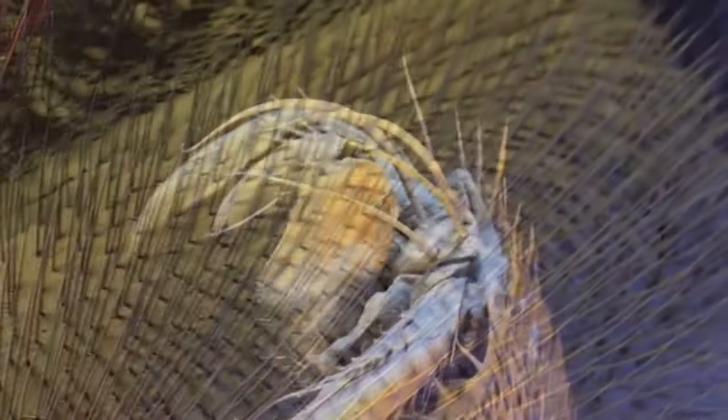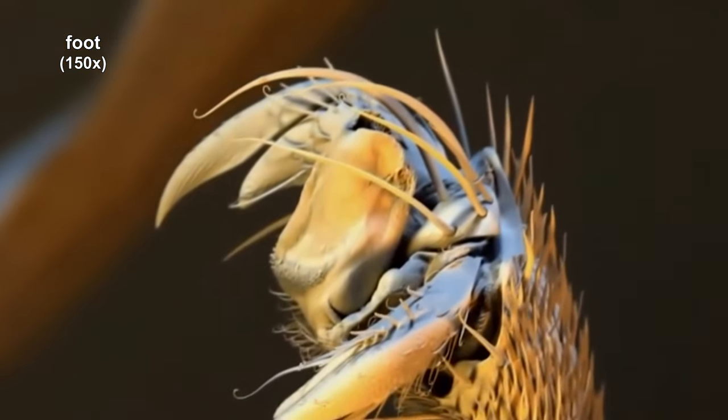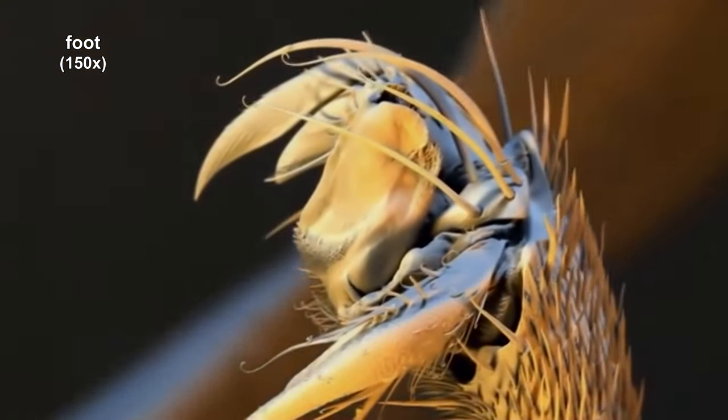Because it's not light, there is no color associated with the images. Color can be added after the image is created by the electron microscope.